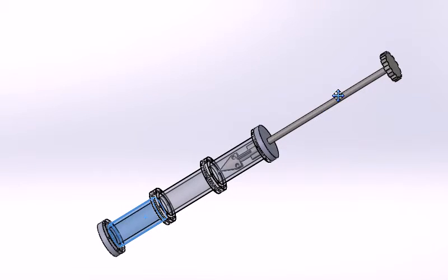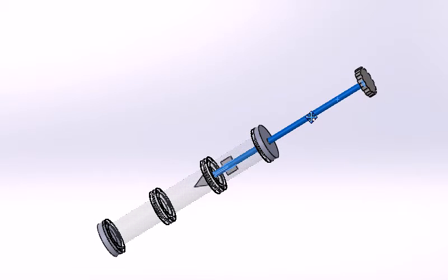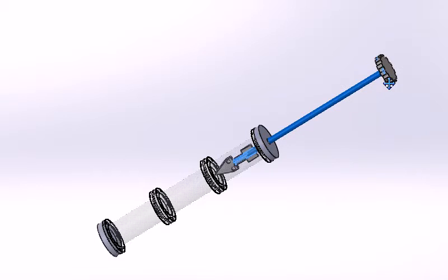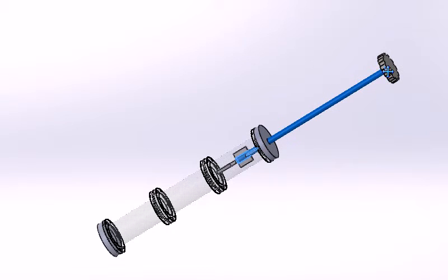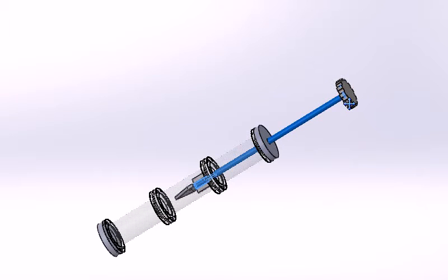If we move this we'll get it to go through the first and then the second barriers. The beginning of the experiment would start like this. We would turn on the motor so that it is mixing and then move it through the first physical barrier to mix the experimental compound with the bacteria colony. After a certain amount of time it would be pushed through the second physical barrier in order to expose the entire mixture to the inhibiting compound.